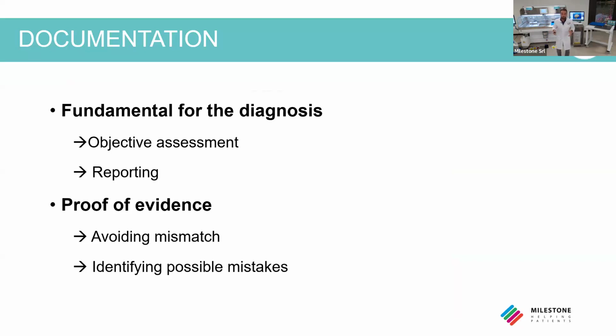It is also extremely important for the laboratory, because it's proof of evidence that a sample passed through that grossing station, in order to avoid mismatches between cassettes and samples. And moreover, it's extremely important for identifying possible mistakes.